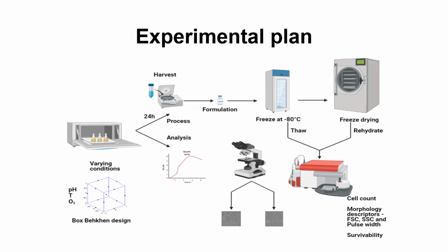These were cultivated for 24 hours and harvested by centrifugation. This was then formulated and frozen at minus 80 degrees centigrade. After 7 days, the samples were thawed and checked for morphology and survivability. A few of the interesting conditions were repeated to study the freeze-drying stress tolerance.